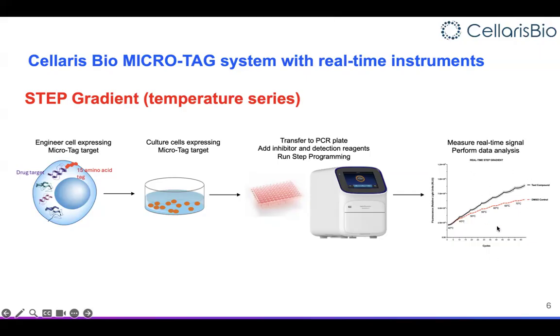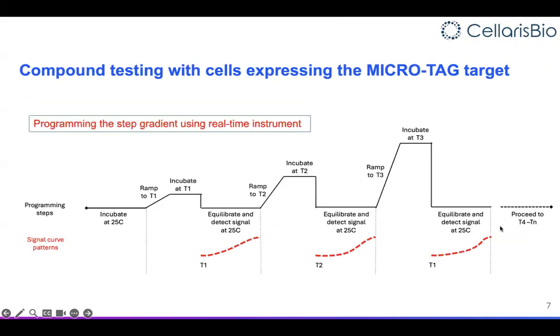And this is what the data would look like. So for the step programming, introducing a temperature series to monitor or interrogate ligand binding, this is what is involved.